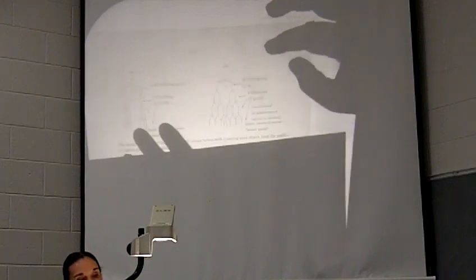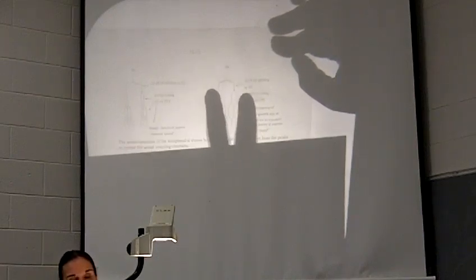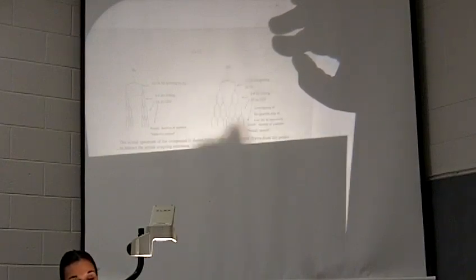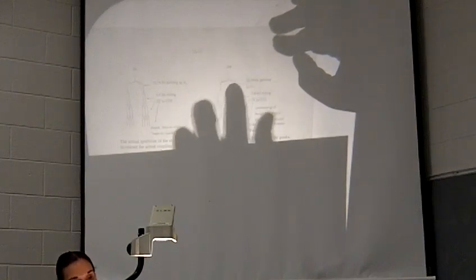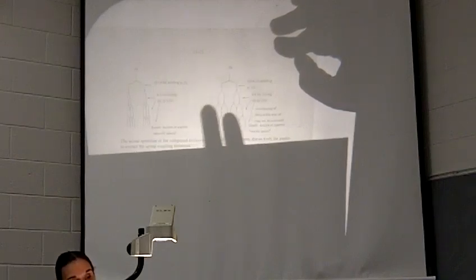Okay. So then for HB, it gets a little more complicated. We've got a trans relationship to HA, so we've split into our doublet from HA, still about 12 to 18 hertz. But that methyl group and HB have a stronger relationship. The coupling constant is greater because it's a vicinal relationship, not allylic. So it's 6 to 8 hertz. And we still get split by the methyl group once, twice, 3 times. There's 3 protons, so we're split 3 times. 1, 2, 3. We end up with a doublet of quartets.